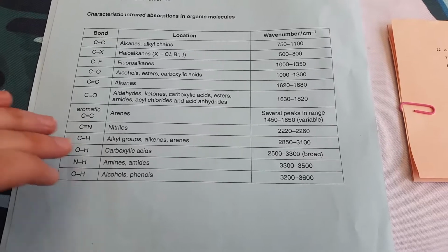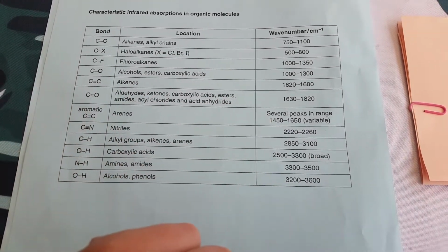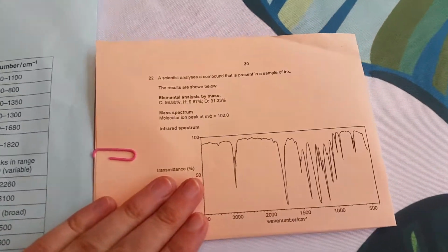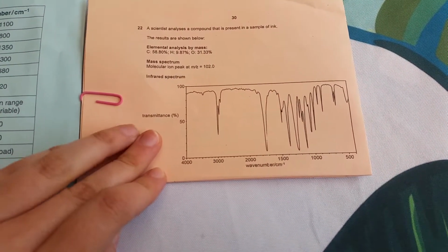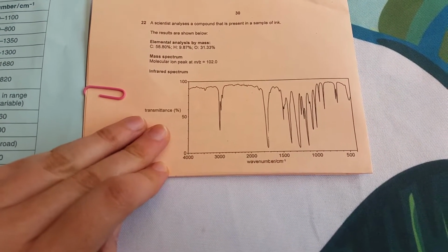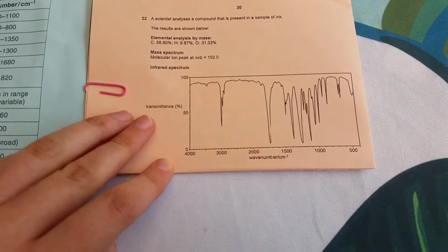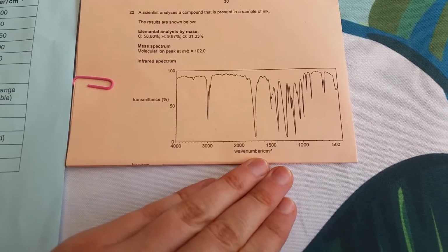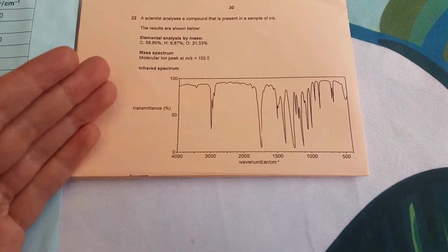So they absorb infrared at different energies within the infrared region. And we're going to use this to interpret this graph. This is a plot of transmittance. Remember, transmittance means the wavelengths that pass through without being absorbed; they're transmitted. So it's a graph of transmittance against wave number, which is just energy. And that gives us what's called the infrared spectrum.